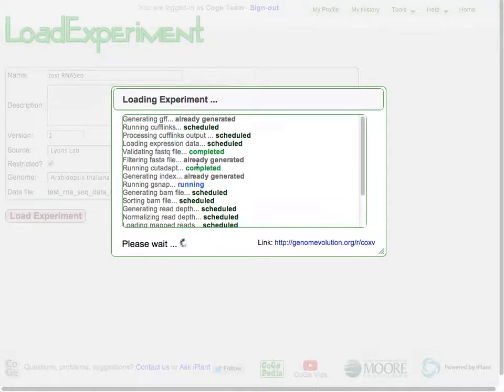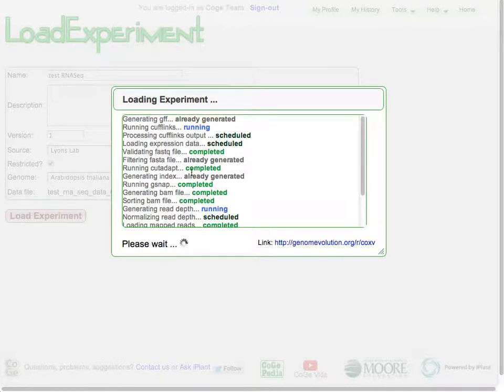Now what happens is we have our pipeline, and what this is showing is all the steps of the pipeline — what's been completed, what's running, what has already been generated, like the GFF file for the genome or indexing the genome for mapping the reads — and it's letting you know how all of these things are scheduled and what's going on.